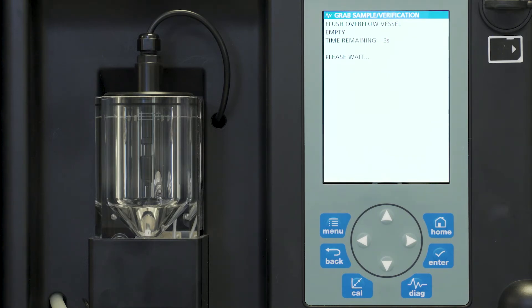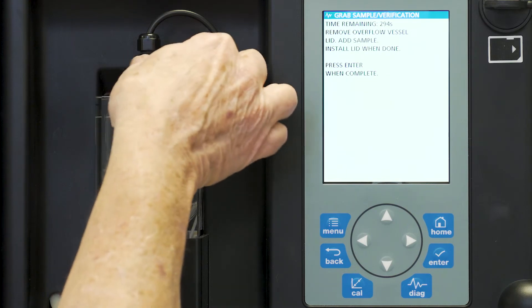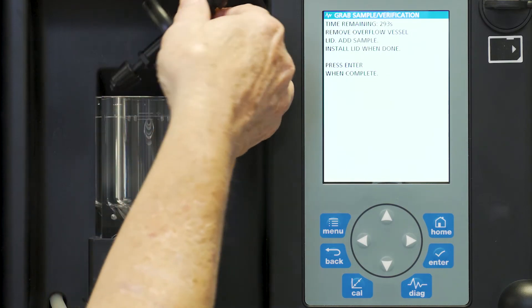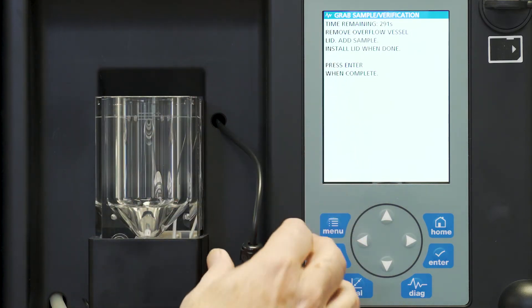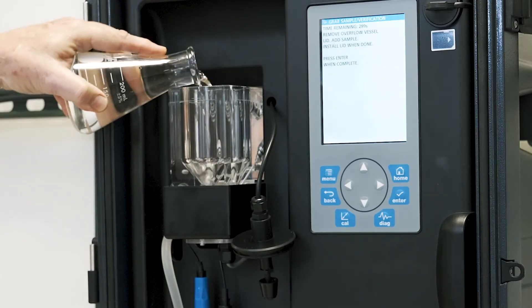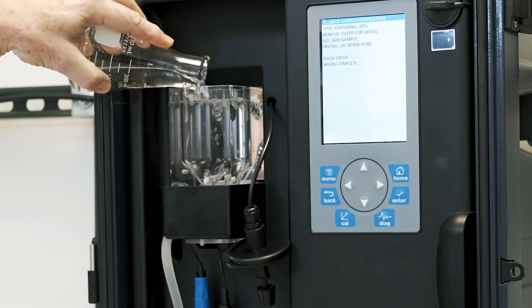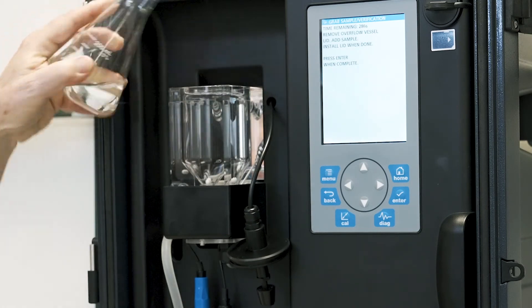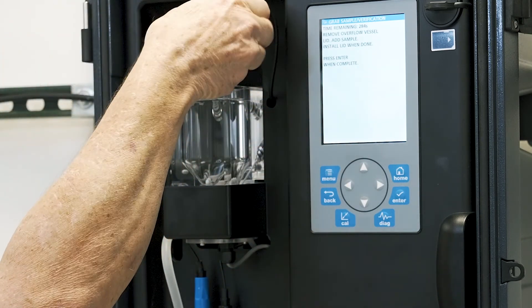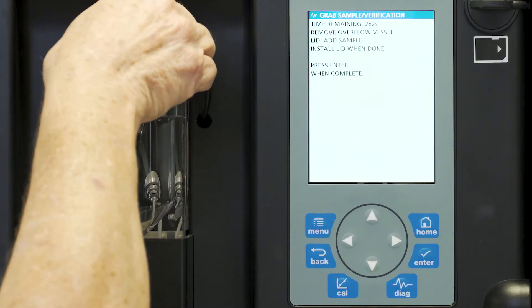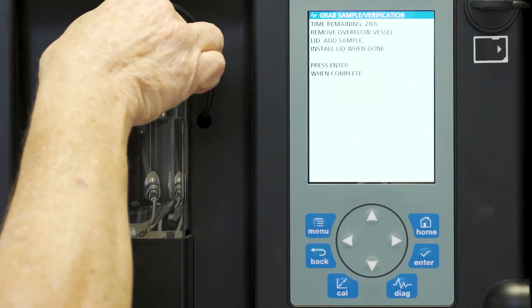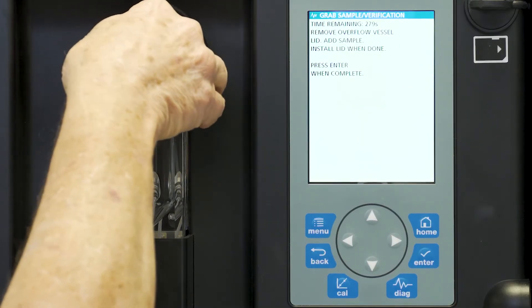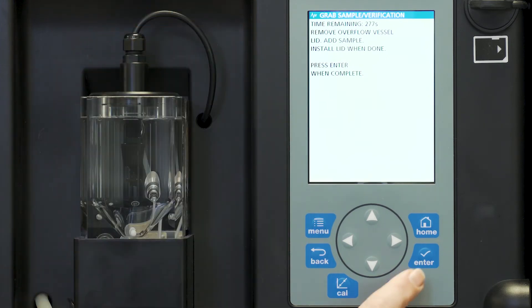You'll notice that we now have finished flushing the overflow cell sample. So now it's going to give us an opportunity to add the remaining sample we want to measure. We first remove the flow level and we pour in our sample. Replace the flow and press enter.